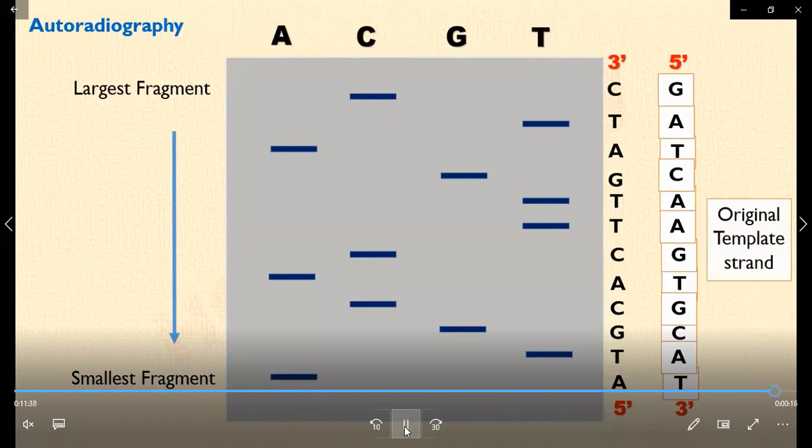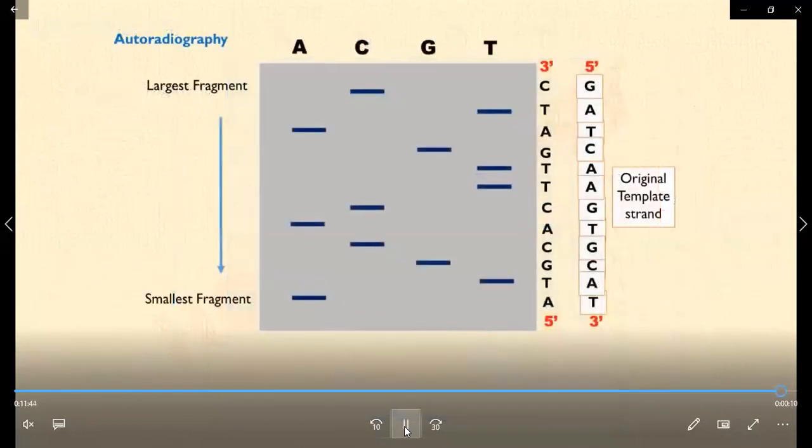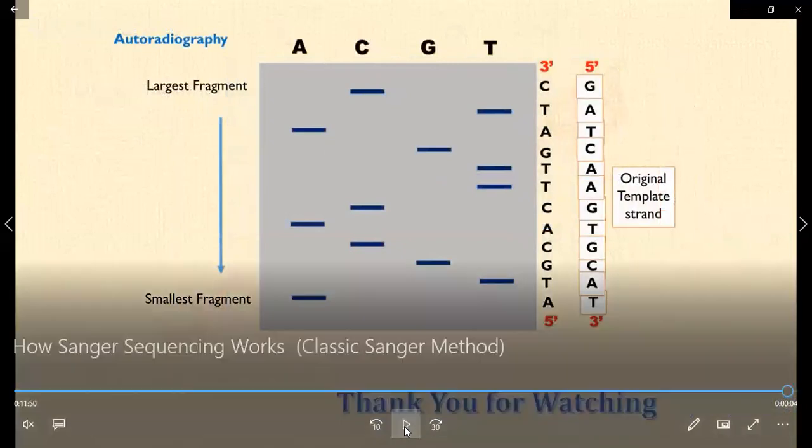इस कॉम्प्लीमेंट्री स्ट्रैंड की वजह से आपको पेरेंट स्ट्रैंड भी पता चल गया कि व्हाट इज इट. नाउ दिस इज द अननोन स्ट्रैंड दैट वी हैड एट द स्टार्ट, और व्हेन यू चेक इट तो ये बिल्कुल ठीक आया है. ठीक है. सो दिस इज हाउ द Sanger सीक्वेंसिंग इज कैरीड ऑन.